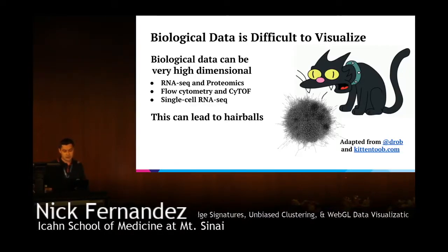Like this figure, yes, you can look at an interaction of 10,000 proteins and point out all their interactions, but what are you getting from it? Will the result be useful? So it's not just a question of can it be done, but what's the point? Why do it anyway? This topic was discussed in relation to flow cytometry data and mass cytometry also.